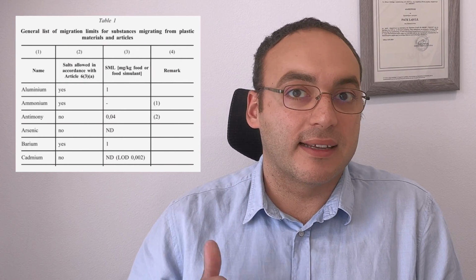For a plastic material in contact with food products, Annex 2 of 10/2011 requires the specific migration testing of 23 metals such as cadmium, iron, and aluminum. The testing process initially requires cutting of flexible packaging materials.